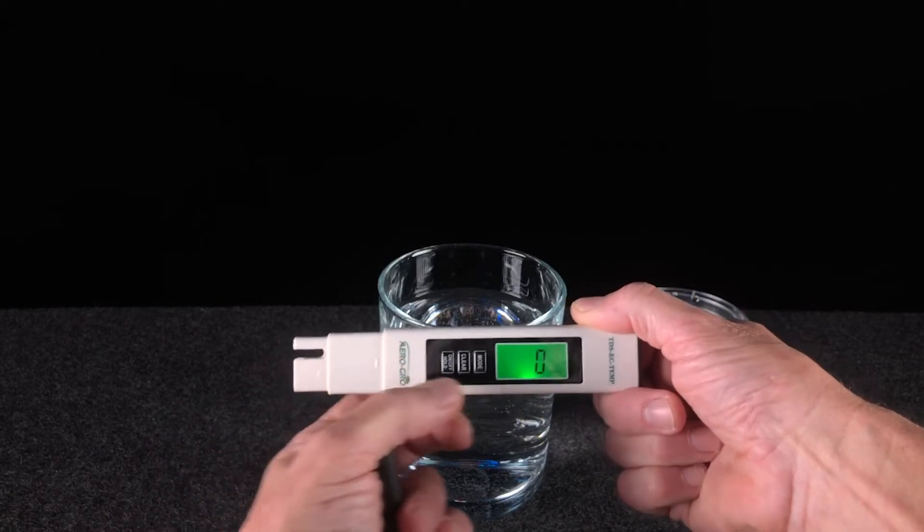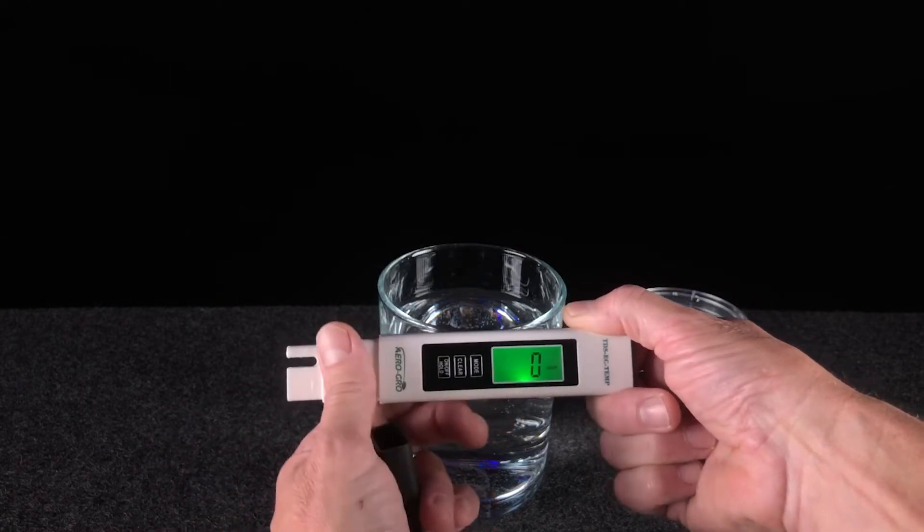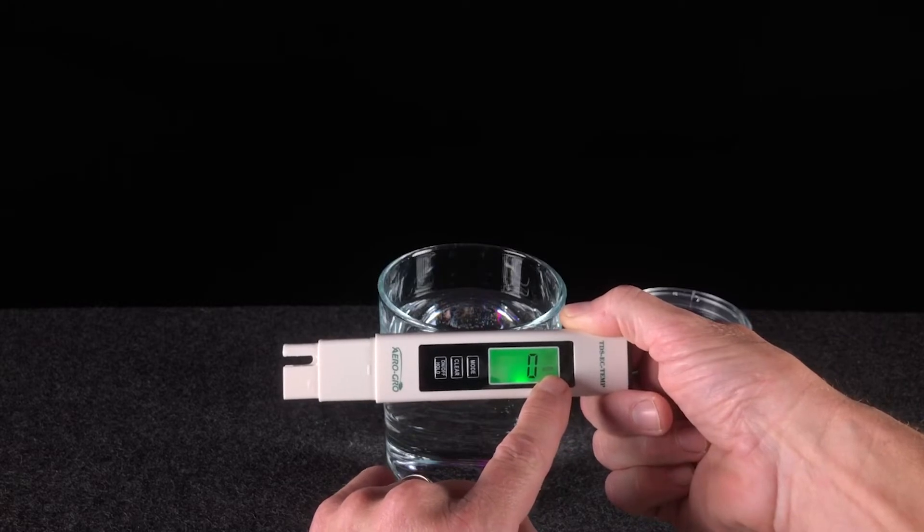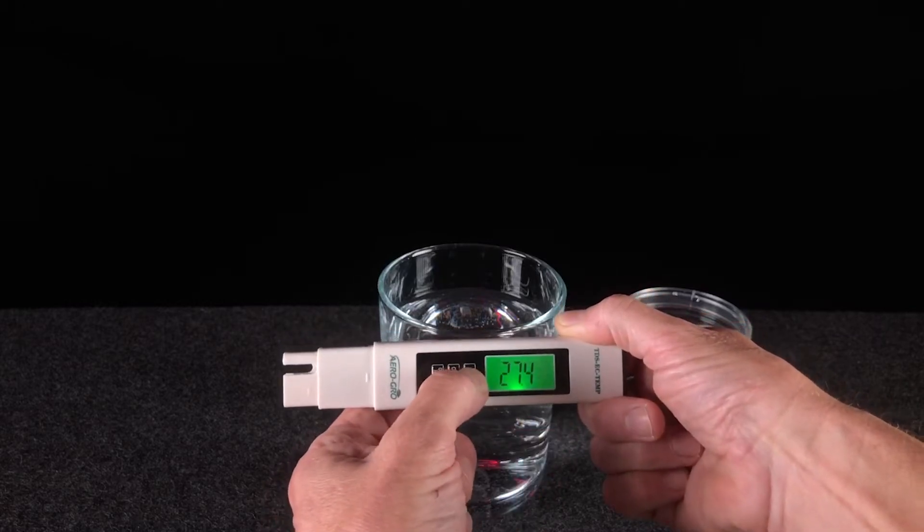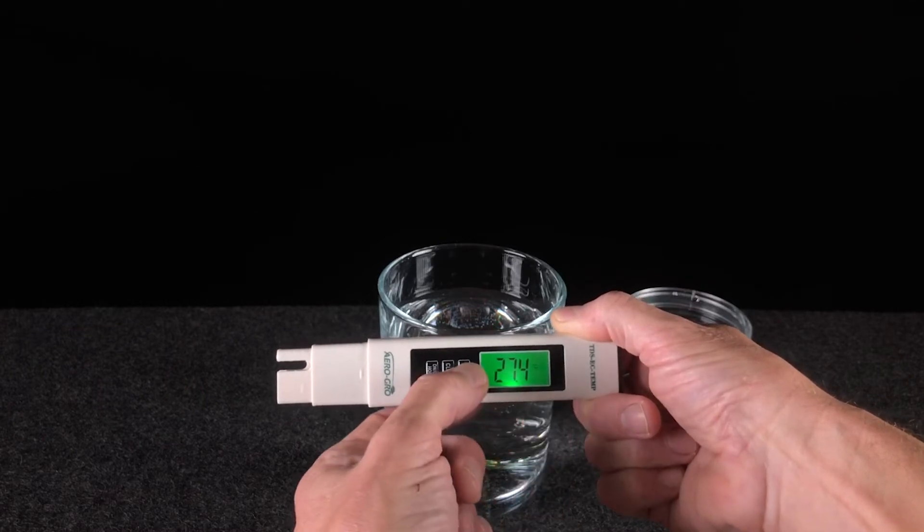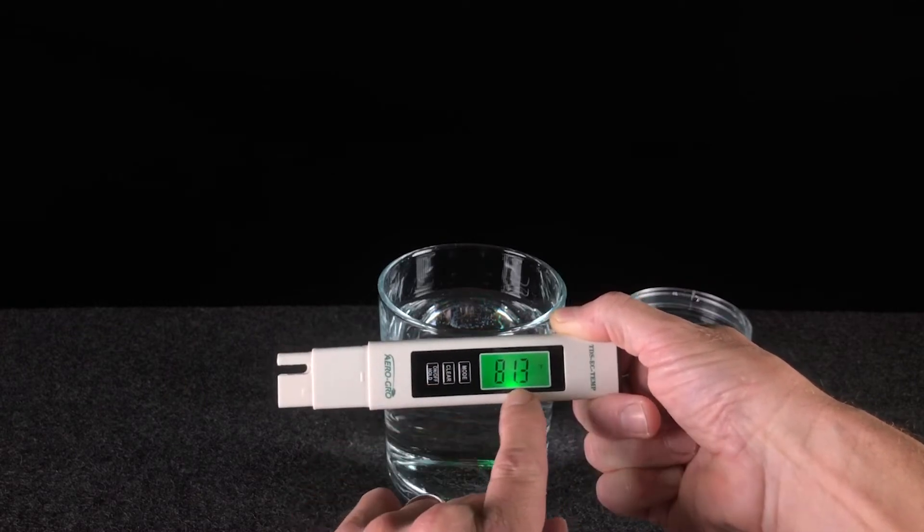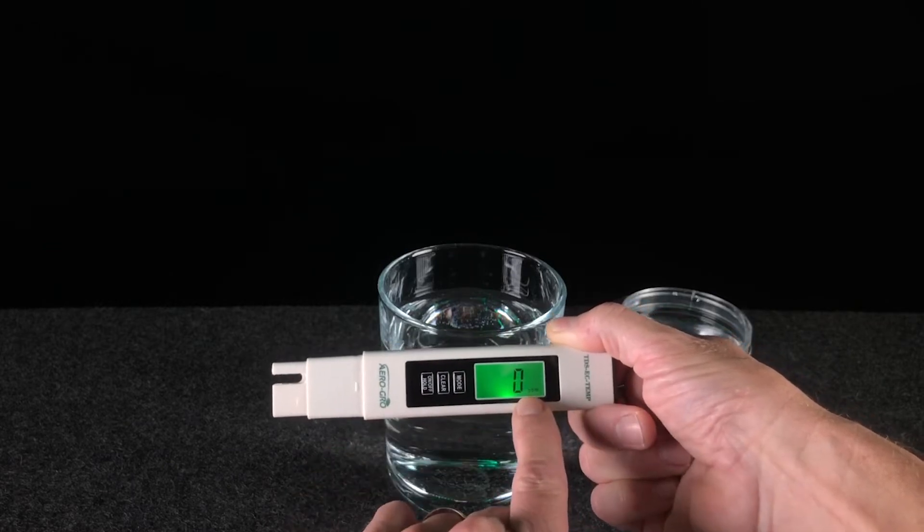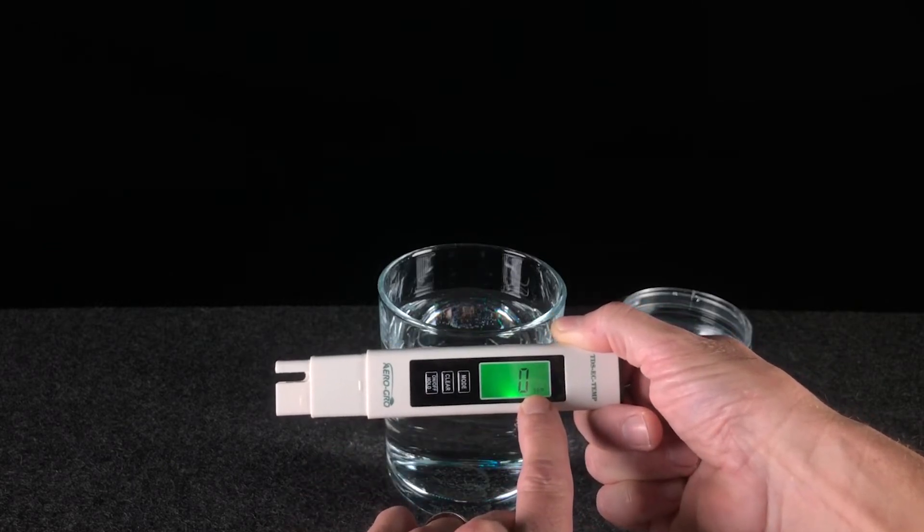If we click this mode button again, we would now be in EC mode, which is measured in microsiemens per centimeter. Click that mode button again, we are in temperature mode, measured in Celsius. Click it again, we're in temperature mode measuring Fahrenheit. And one more time brings us back to TDS, measured in parts per million.